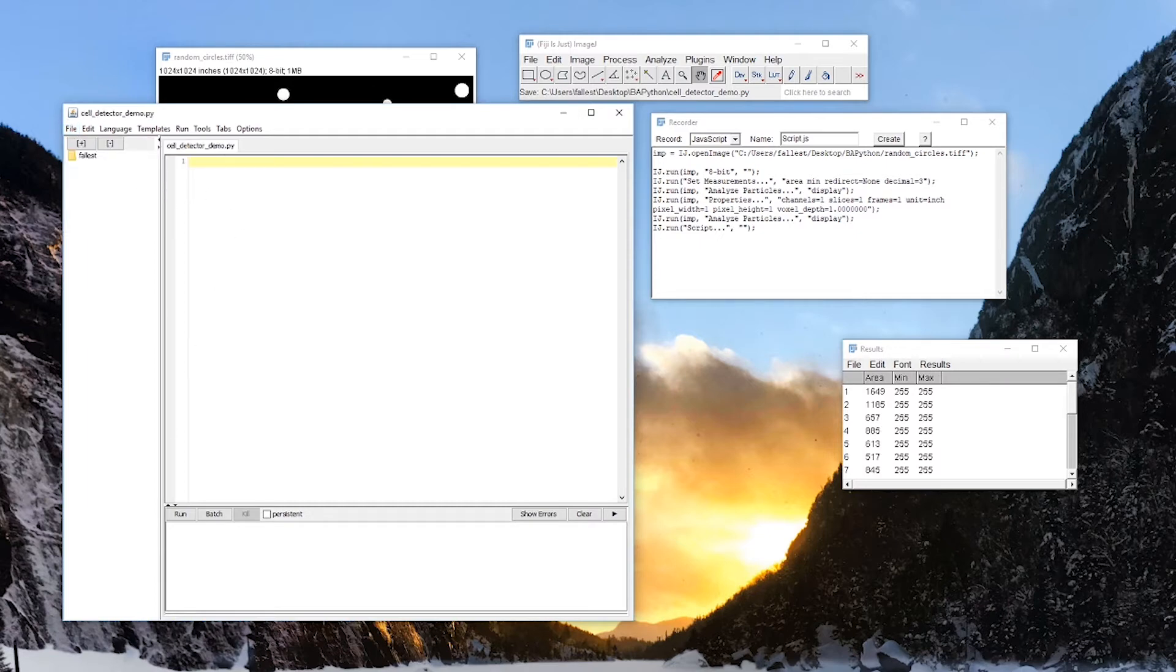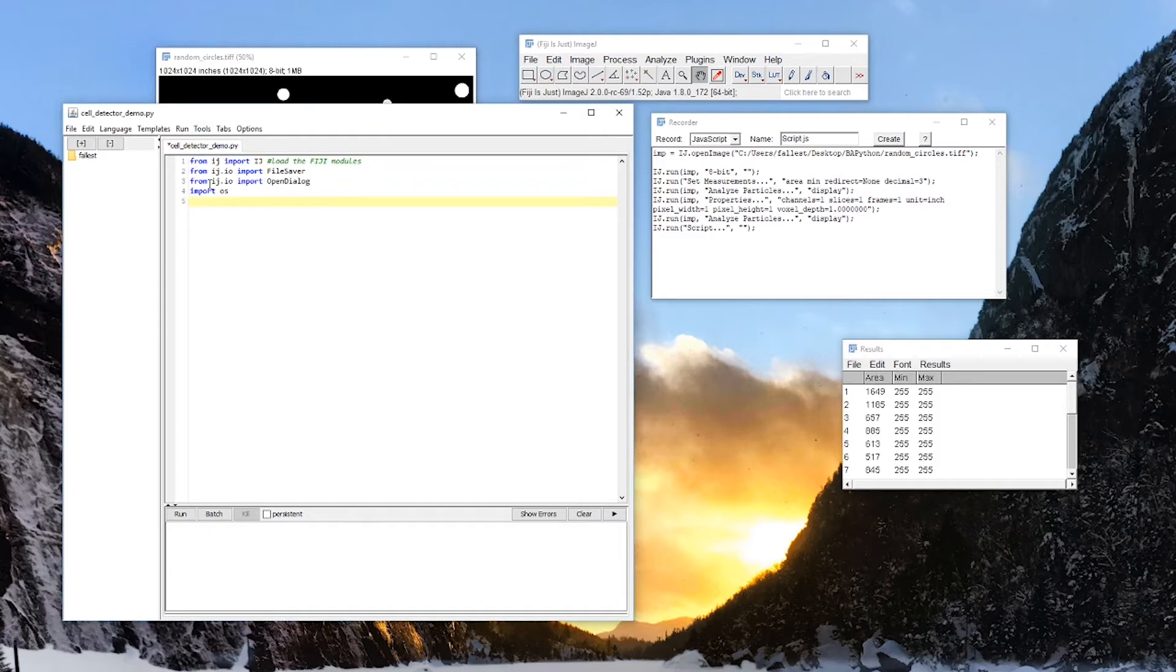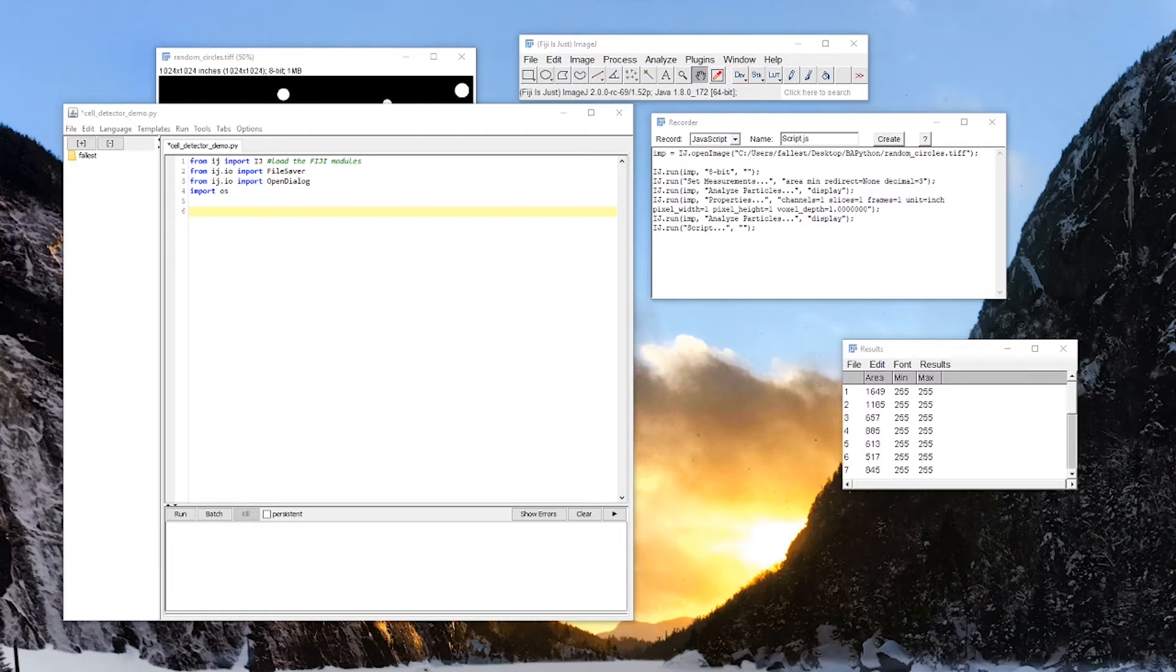So the first things that we need are to import some libraries. So from IJ, import IJ, from IJ.io, we're going to import the file saver, IJ.io, import open dialog, and import OS. The reason we're importing these is so we can save the files. This is the method for saving files, and open dialog. Why do I want the open dialog? Because I'm going to give you some quick code that makes your life a bit easier.